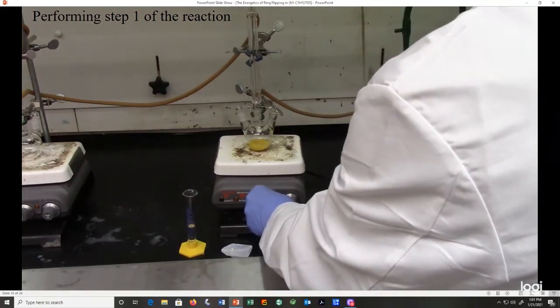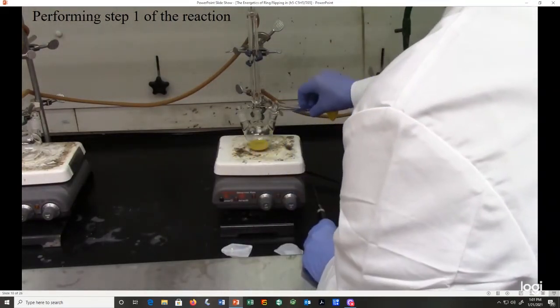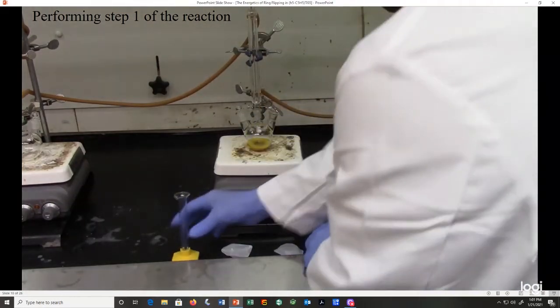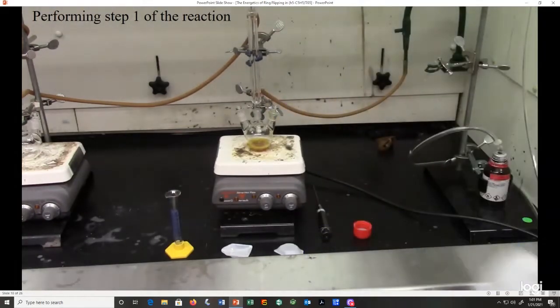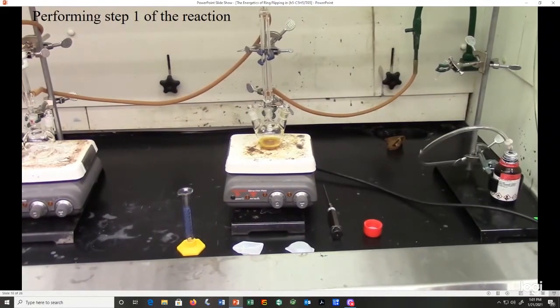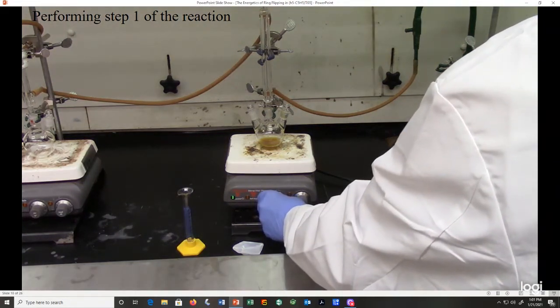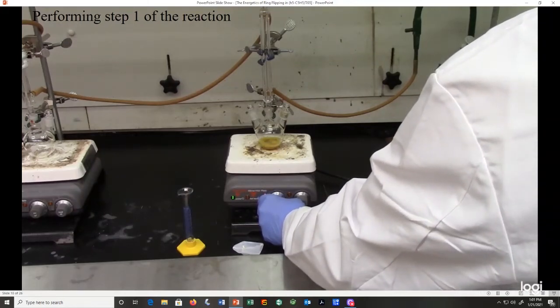Okay, so at this point we're going to add a few milliliters of THF just to make sure that everything gets down into the reaction flask. I'm going to replace the stopper, and we'll set the stir bar. And then we're just going to let that react for 20 minutes.